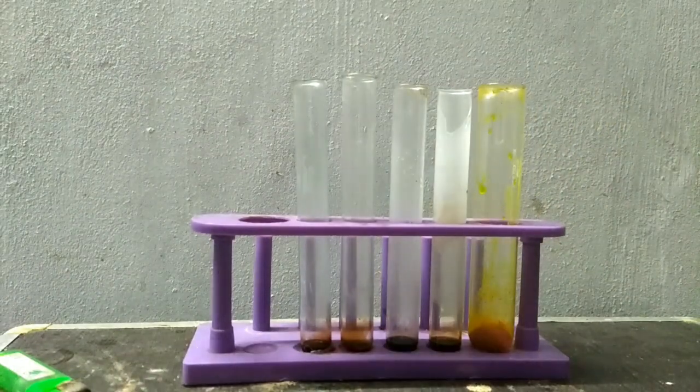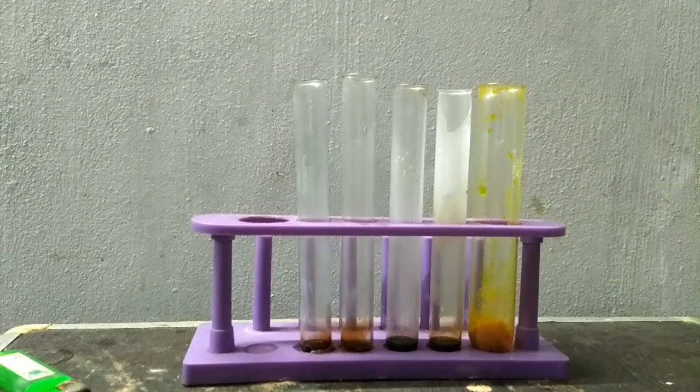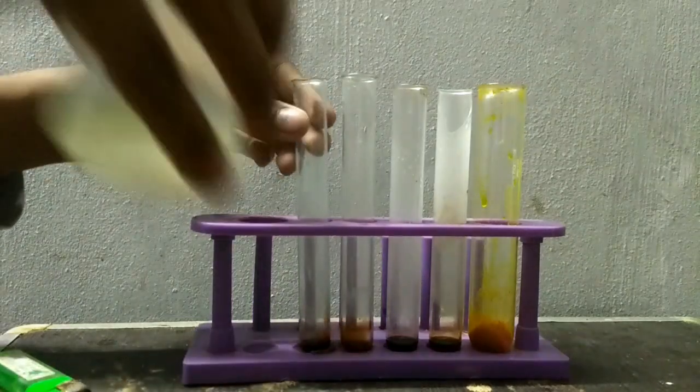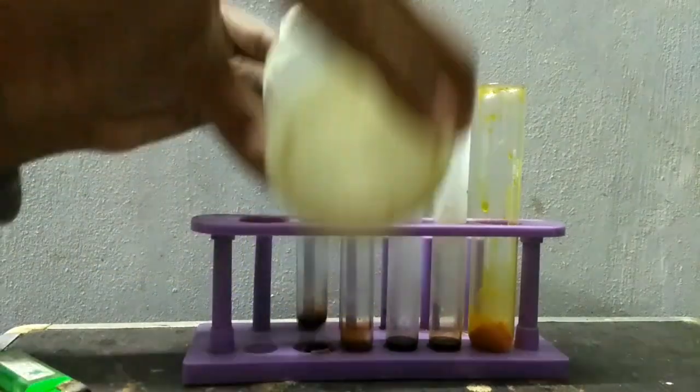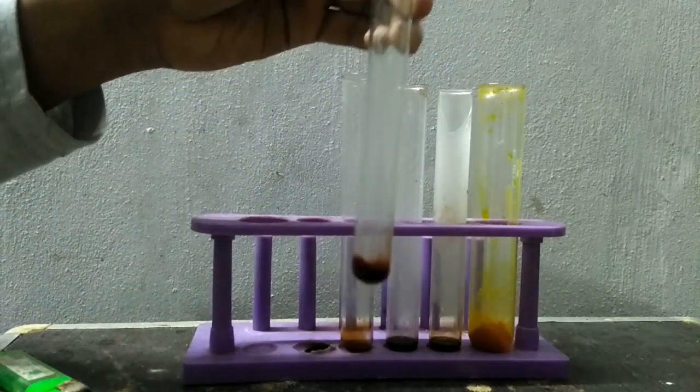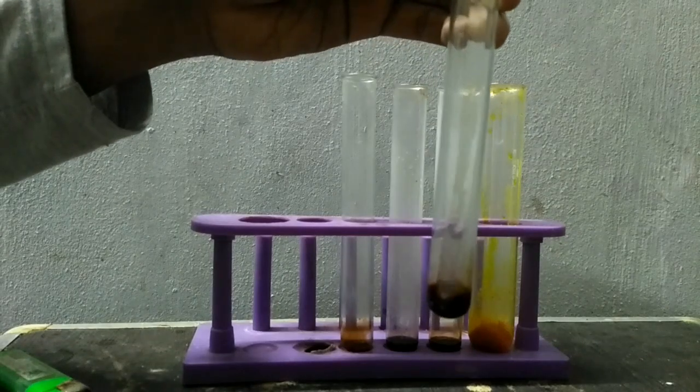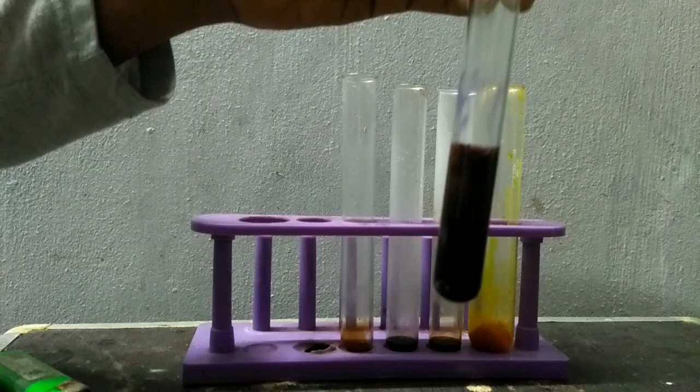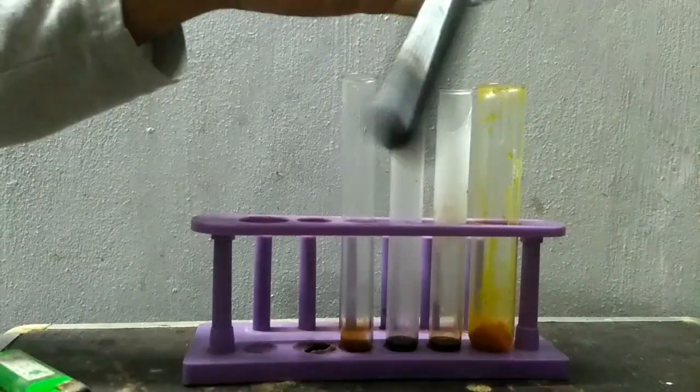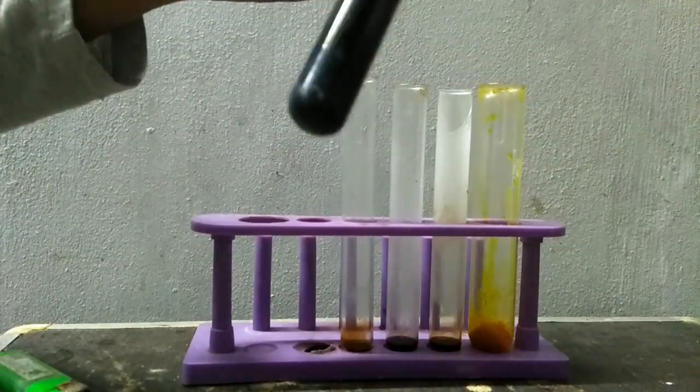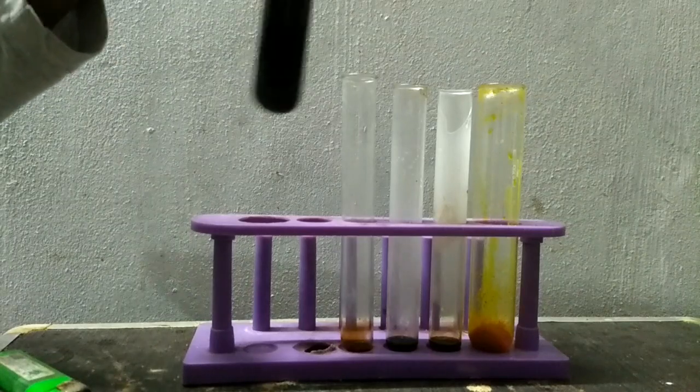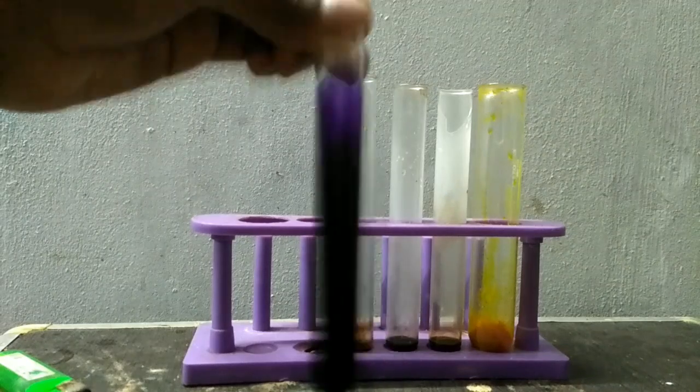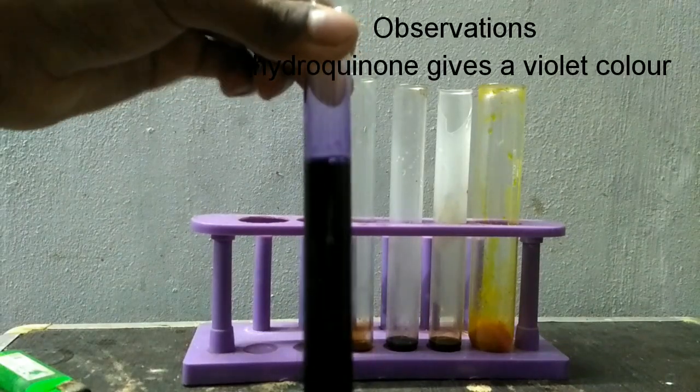Now in the second step we add sodium hydroxide to each one. First we will add to the hydroquinone one and we will see appearance of a violet color.